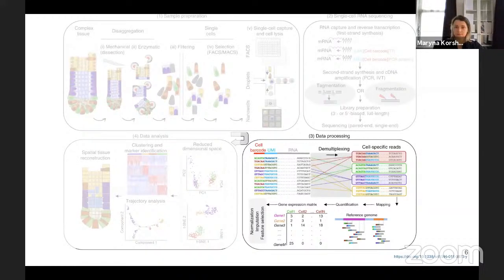And it's obvious that you do this cell demultiplexing step when you have the cell barcodes. Sometimes you can also apply cell hashing, and during cell demultiplexing, you also analyze which cells came from different batches, and which reads are assigned to these particular cells.